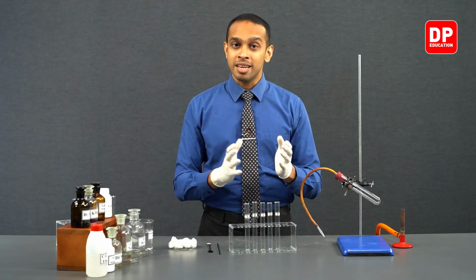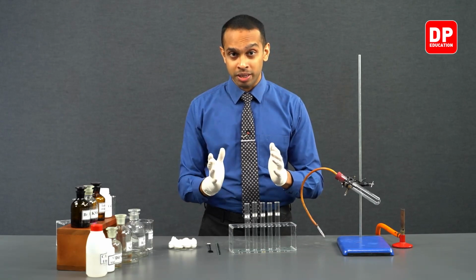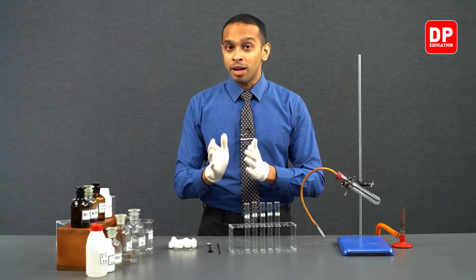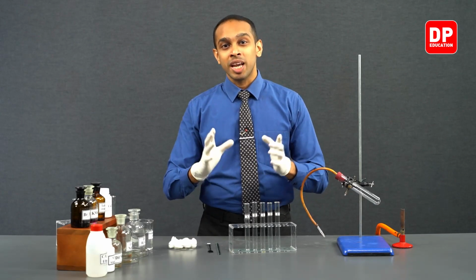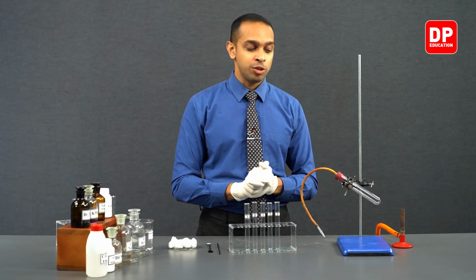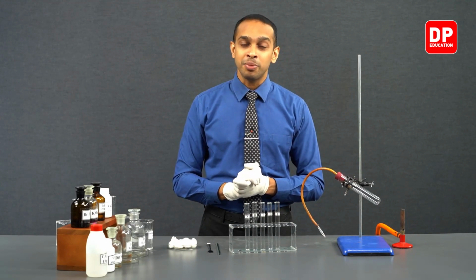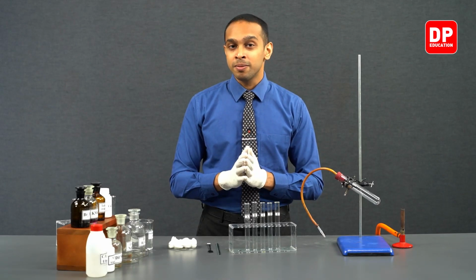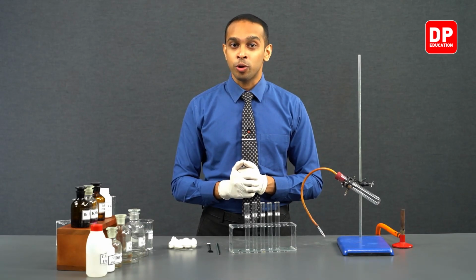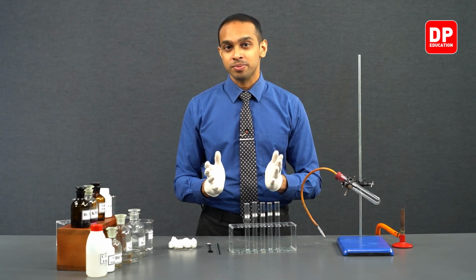When ethanol is sent over heated alumina, ethanol undergoes an elimination reaction to produce ethene gas. That is what this setup is for. So we will be producing ethene gas by sending ethanol vapor over heated alumina.